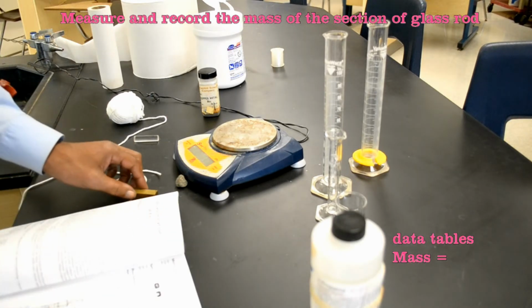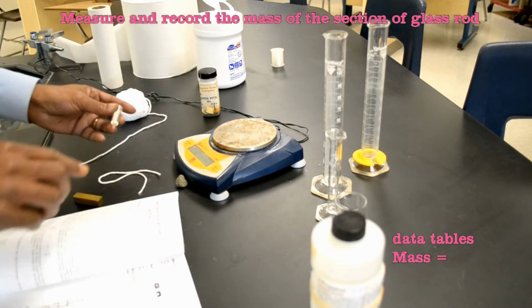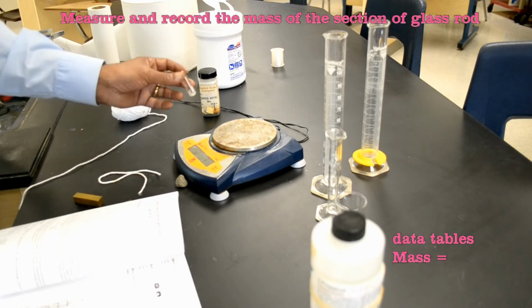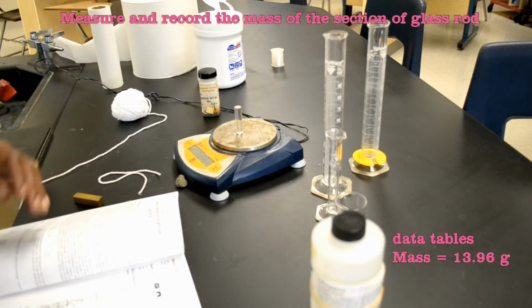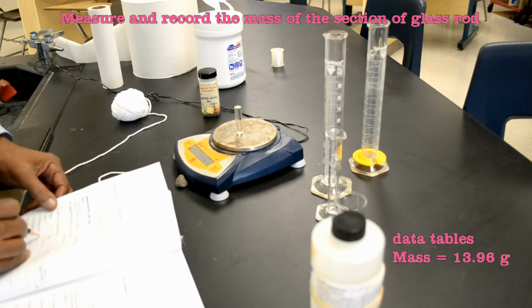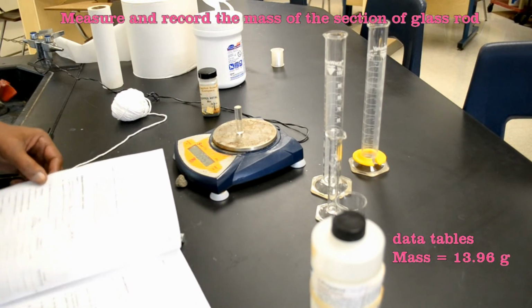Measure and record the mass of the section of glass rod. So I'm going to turn on my balance. The mass is 13.96, so I'm going to record that here, 13.96 grams.